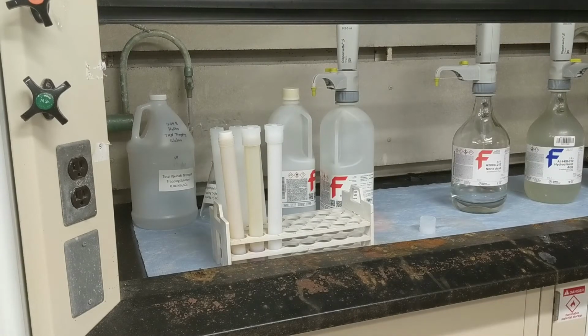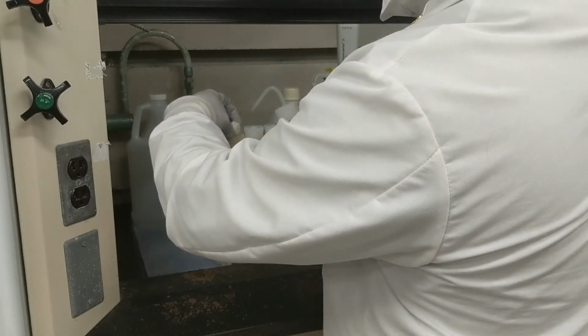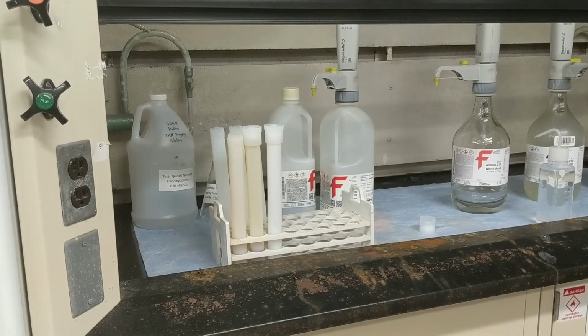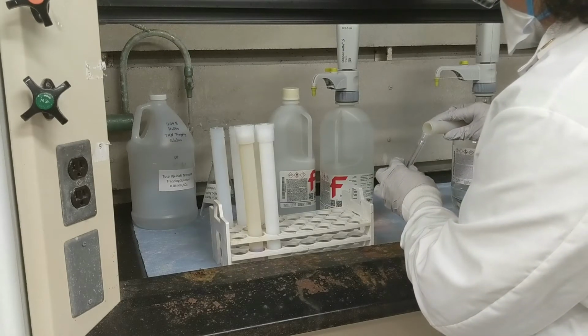Once you have the cap off, we want to get a deionized water squirt bottle and squirt the bottom of the stopper into the vessel to make sure anything that's on the stopper gets into the vessel. And then it's time to carefully pour from the digest vessel into our volumetric flask.